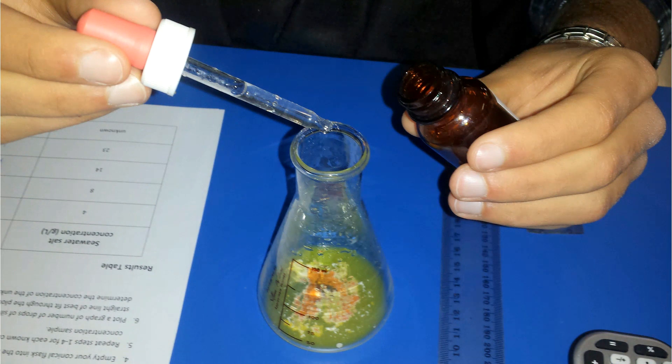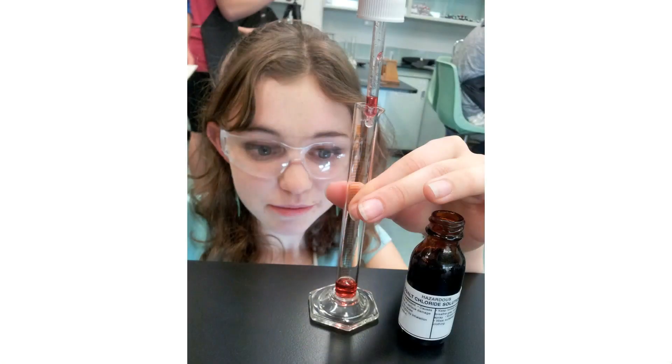Here a student is using one to test the salinity of seawater. Here Alicia is very carefully measuring out a certain amount of cobalt chloride solution using a small measuring cylinder. The smaller the measuring cylinder, the more accurate the measurement — so if you're only measuring out a few mils, you would use a small one like this.